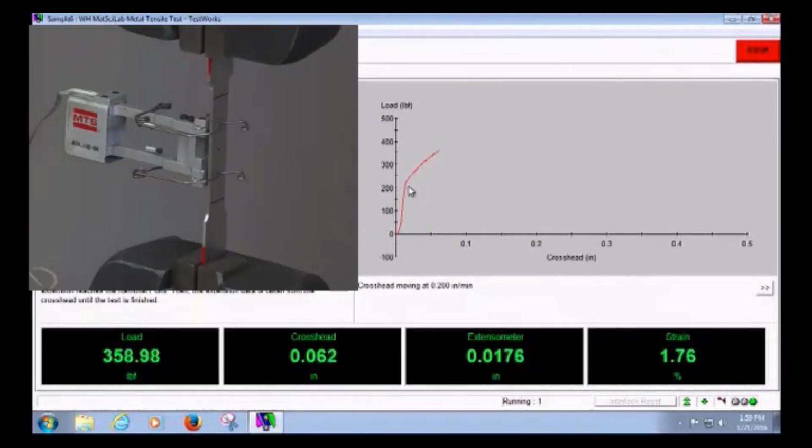All right, you can see all of the values changing on the displays. When we reach 5% strain, we're going to get a pop-up message below the graph telling us that the removal point has been reached. 2 reasons for that. 1, the extensometer has a finite measurement range. We want to stay comfortably within that. So 5% is well within that range.